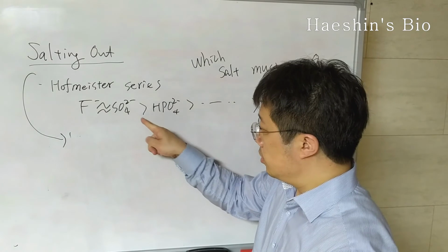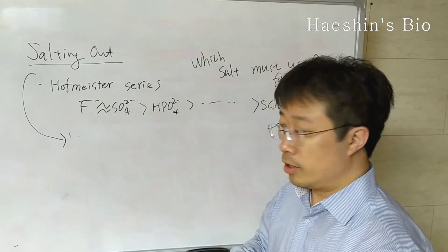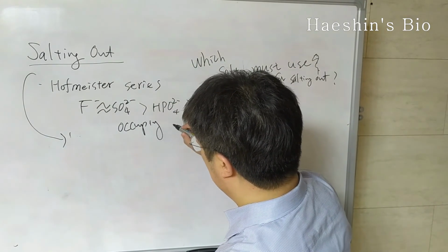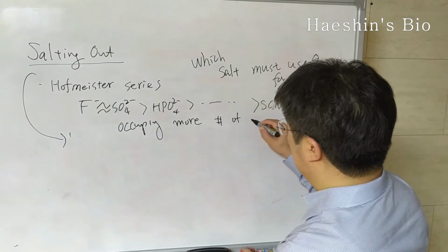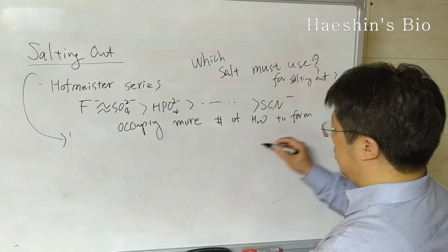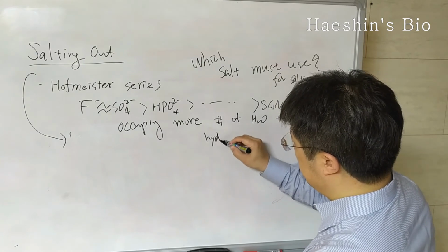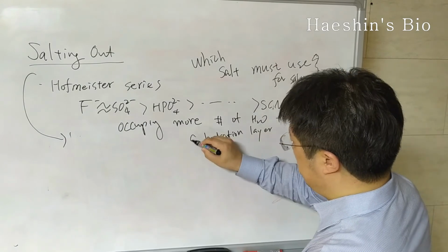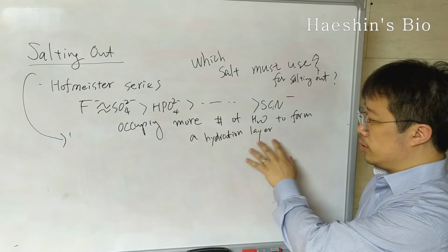That means the higher in this series, the more it occupies, so occupying more number of H2O to form the hydration layer.